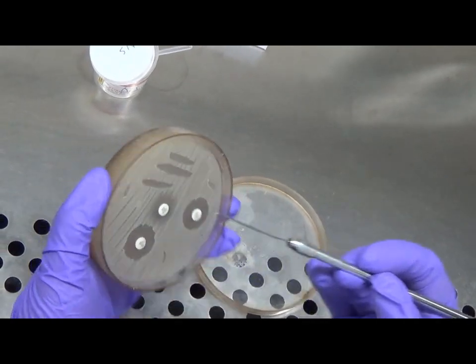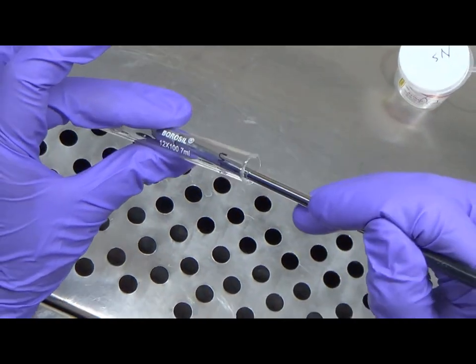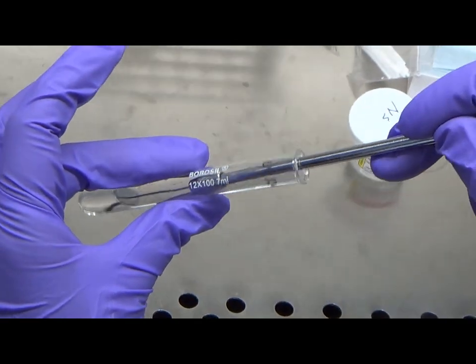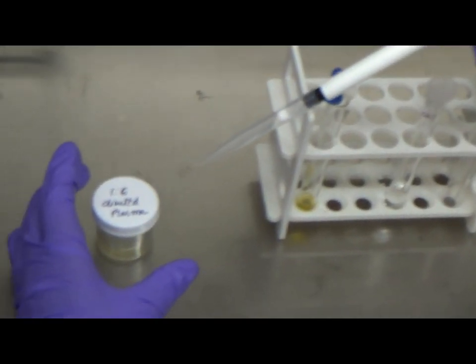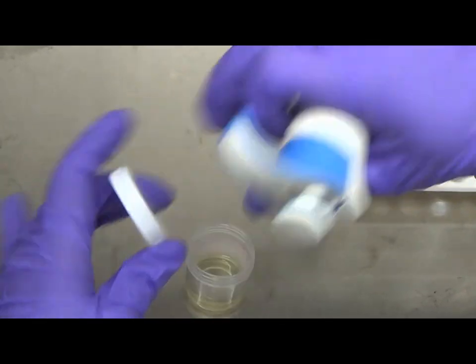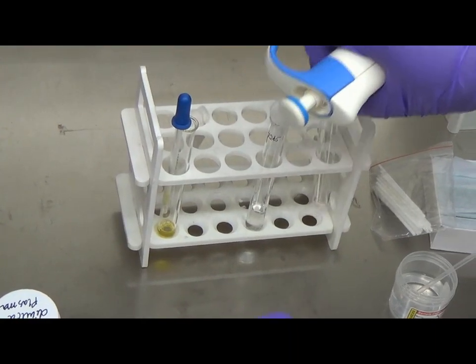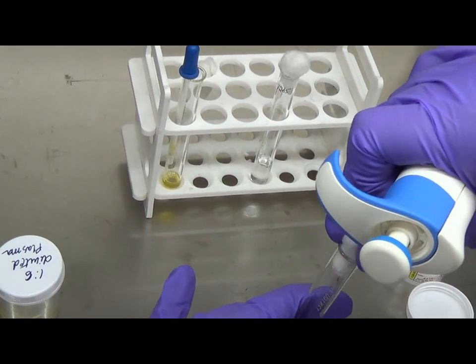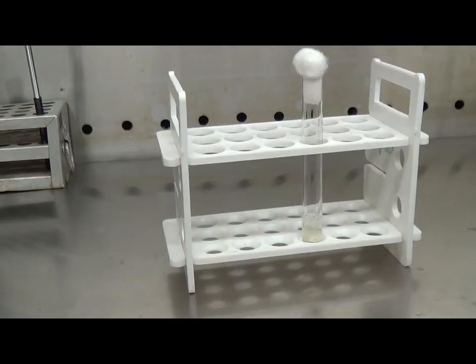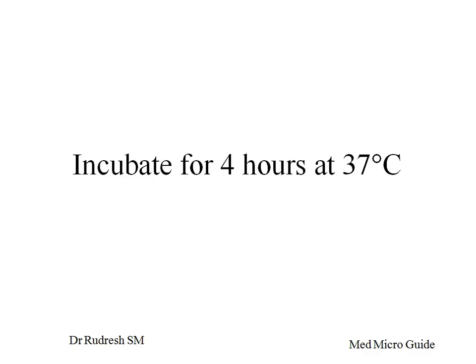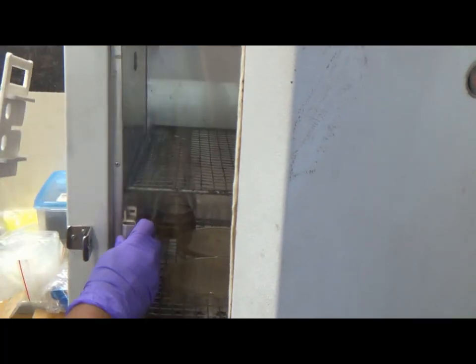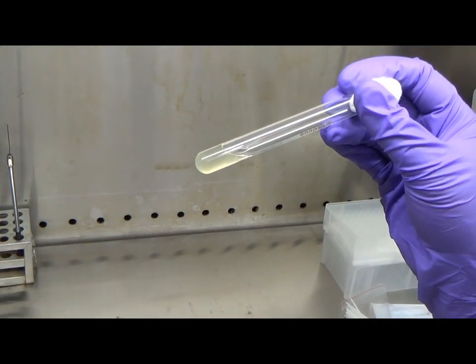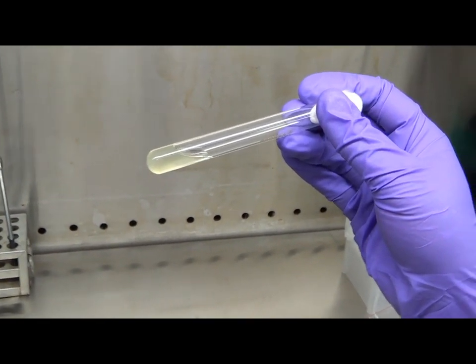Emulsify a small amount of colony in 0.5 ml of saline or 0.5 ml of plasma. If you are directly putting it into plasma, you can incubate the tube at this stage. Add 0.5 ml of diluted plasma to the 0.5 ml of inoculum made in sterile saline. The tube is now ready for incubation. Incubate the tube for 4 hours at 37 degrees Celsius. At 4 hours, look for the presence of a clot. The tube should be gently tilted to note the degree of clotting. Do not shake the tube, as it may disrupt the partially formed clot.